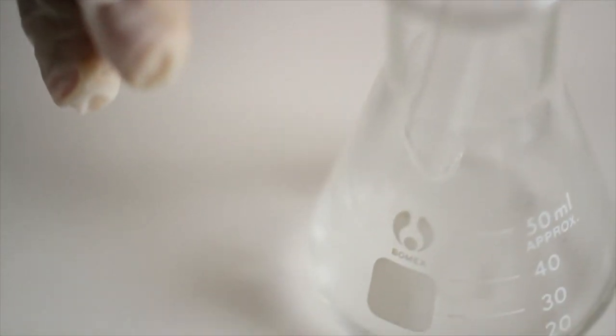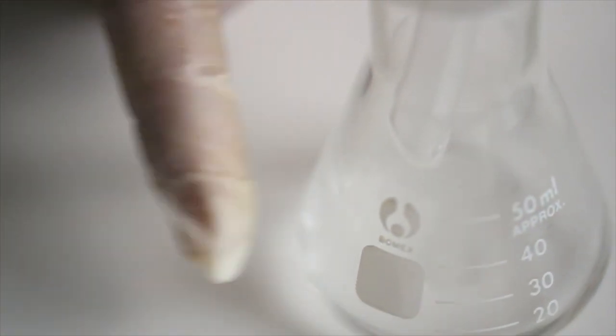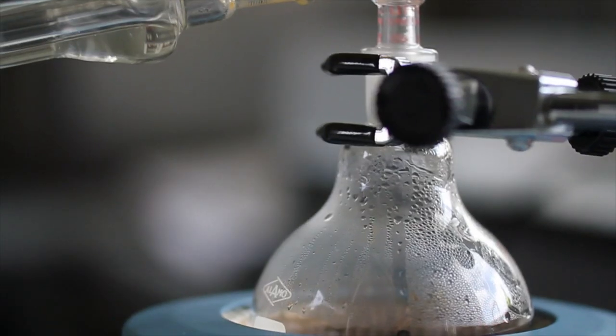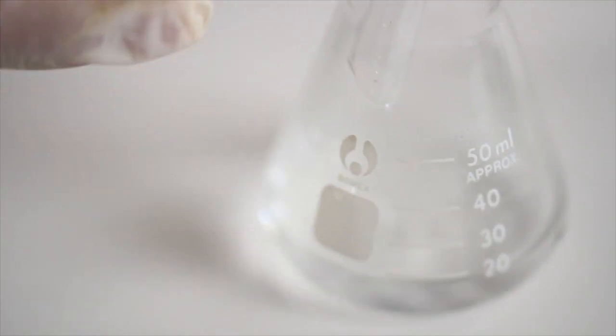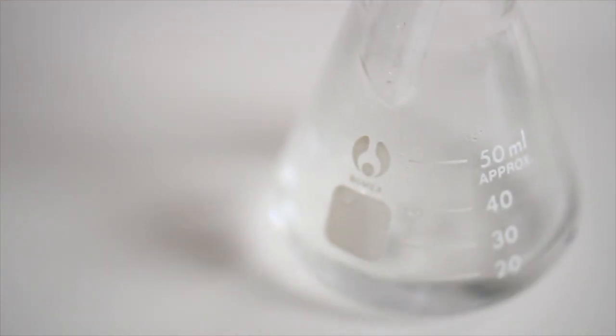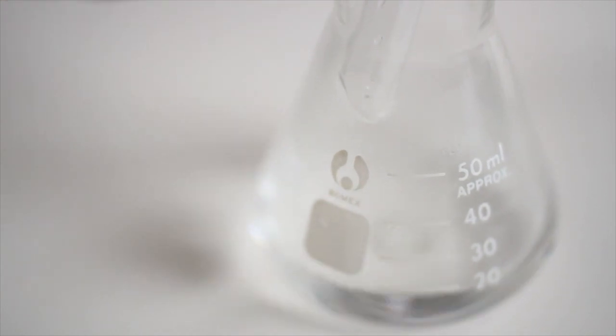Temos que estar destilando hasta que teñamos a seguridade de que todo o alcohol que estaba inicialmente no viño pasou ao matraz Erlenmeyer. Para ter a seguridade de que pasou todo ese alcohol, esperaremos a ter uns 60 ou 70 mililitros recollidos.